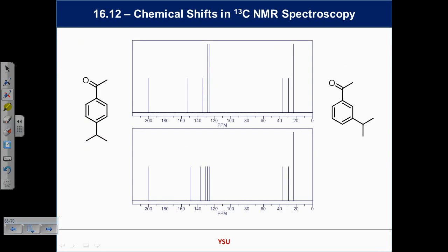Now, this becomes very useful if you're on top of it to be able to solve problems quickly. And that can be a problem on the next test. We have 2 samples. One of these things is a poison, one of these things isn't. And you've got to drink the right one. Of course. So you take out your NMR spectrometer, and you take a sample and you measure the spectra of each of them, and you try to work out which is which. And on the left I have the good molecule, let's say. On the right I have the bad molecule. Which is which? Which spectrum belongs to which molecule?